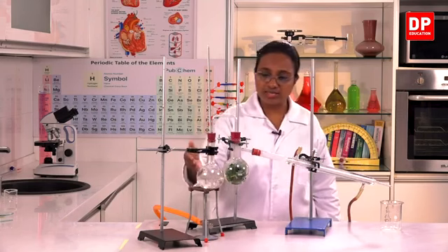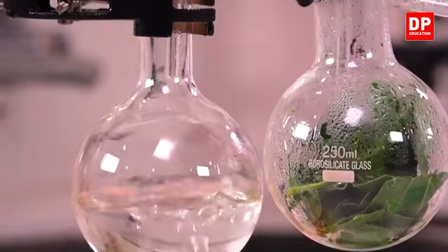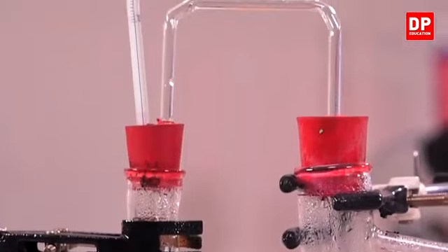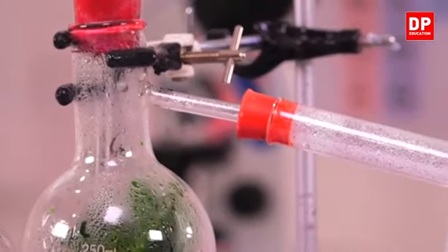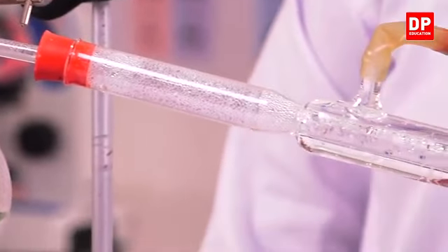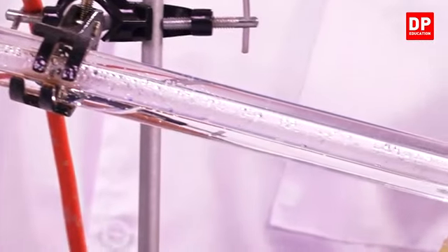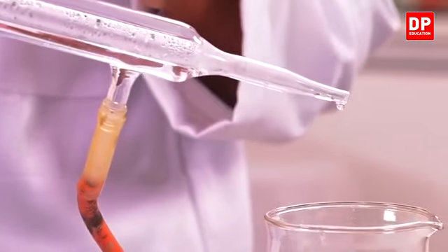Now, of course, you can see the water boiling. So, the steam is passing through and here you can see there is the liquid coming out. Since I am doing the activity, I can get the smell of cinnamon oil. But here you cannot see the two layers separating because of the small volume that has been collected.